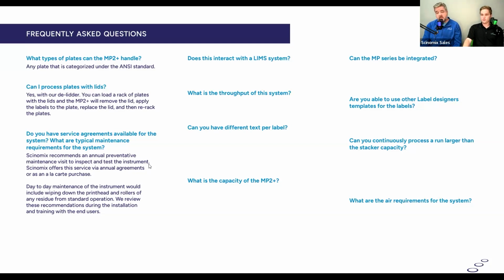or you can also do service agreements, which include the preventive maintenance service. Most of the maintenance that you need is covered. In the preventive maintenance, they'll check bearings, check belts, all of that in the conveyor, also in the stacker. What you can do before that is when you are changing labels. We sell our label kits with 2 rolls of labels and 1 roll of ribbon. After you've changed the ribbon, you've done 20,000 plates at that point, which is quite a few, so you might need to clean the print head. There are a couple of printer things you can check to make sure there's not any residue or print parts there that you can clean off. You can clean that with isopropyl alcohol. Make sure it's dry, then reset the labels, do a couple of test prints, and then you're good to go with it. Sure, sure, doesn't sound too bad.